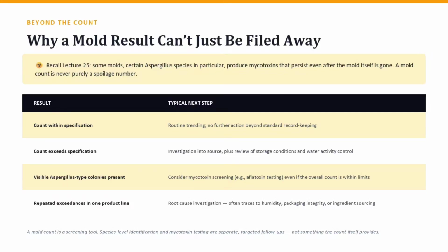Here's the core point to take away: a mold count is a screening tool. Species level identification and mycotoxin testing are separate, targeted follow-ups. The count itself does not provide either of those on its own.